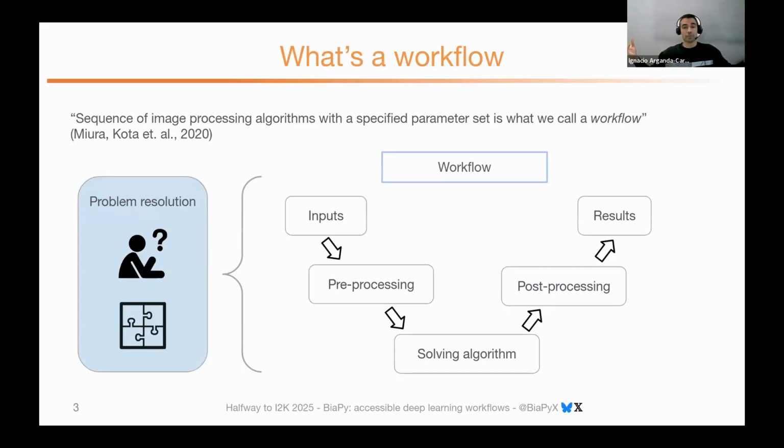This is a general description, where we have some inputs. In our case, they are always images of any type, as we will see, and usually they don't come in a proper way, so we have to pre-process them, normalize them, to do many different things, so we can pass them to what we call the solving algorithm.